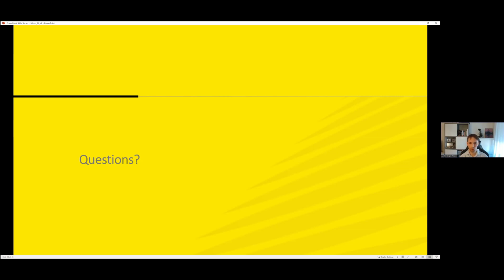I have seen situations where people were taking images on some other, even manual, systems and then using Nikon AI to do the segmentation of these images. You can use a TIFF image if you would like as an input and still use our segmentation or enhance something like this on it. Okay, thank you.